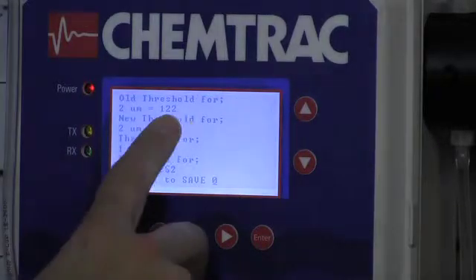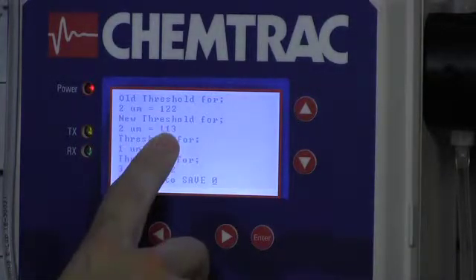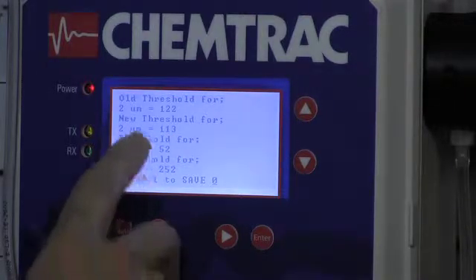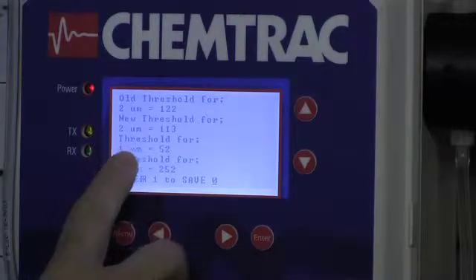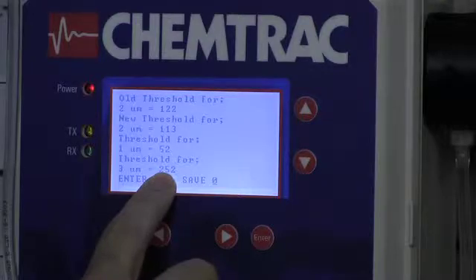It's going to show us what our old threshold value was, which was 122. Our new threshold value is 113, and it also tells us what the neighboring thresholds were. So 1 micron threshold, which we're not looking at 1 micron particles, but there is a threshold there for it. It's 52, and 3 micron is 252.